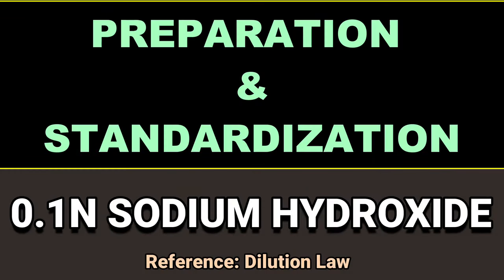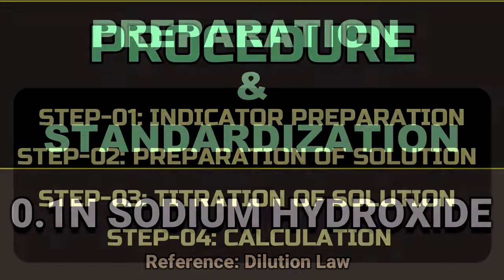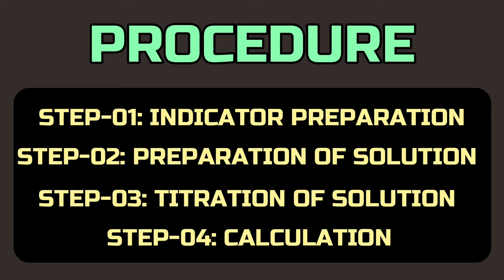Chemical and reagent preparation is very important for any test to get the accurate test result. Today, we are going to prepare and standardize 0.1 normal sodium hydroxide solution. This method involves four steps: indicator preparation, sodium hydroxide solution preparation, titration of the prepared solution, and calculation.